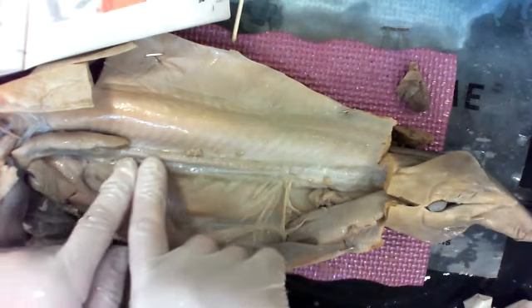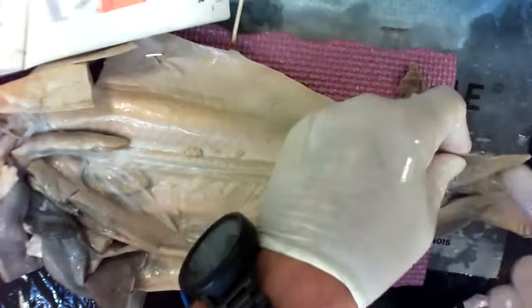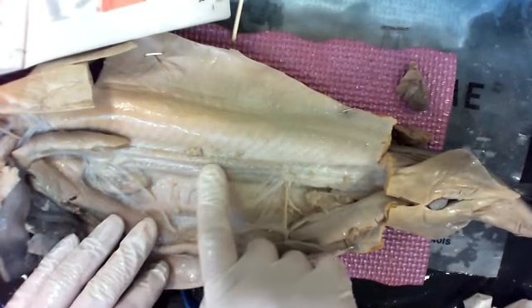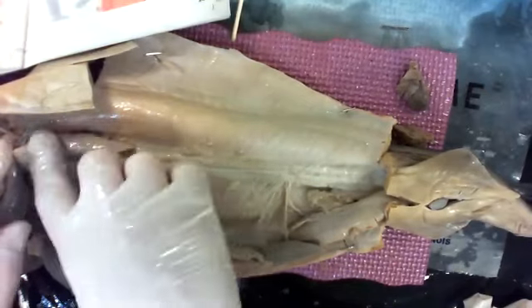So the vas deferens carries the sperm all the way down here, all the way down. It's coiled, but it straightens here and goes straight down and dumps to these. So it dumps into the environment close to the female, and then the sperm go into the female and cause fertilization. If you have a female, you'll have the same pathway, but they're not coiled. It's a straight tube that goes all the way down. And you'll probably have something that's kind of like this, but it probably has a bunch of round balls all over. Those balls are eggs. So this would be an ovary in the female, and those things developing are the eggs.